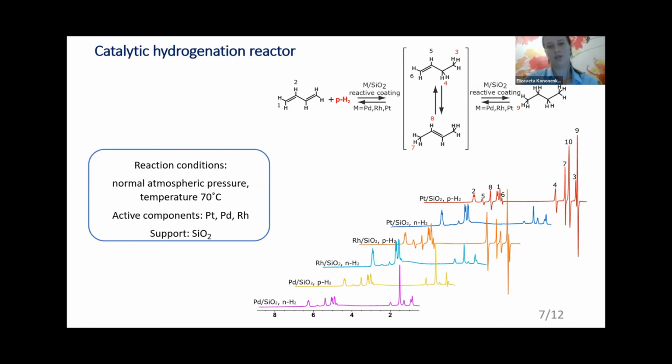However, these two types of catalysts didn't show any selectivity for incomplete hydrogenation products. That is, all reaction products were observed and all were polarized.